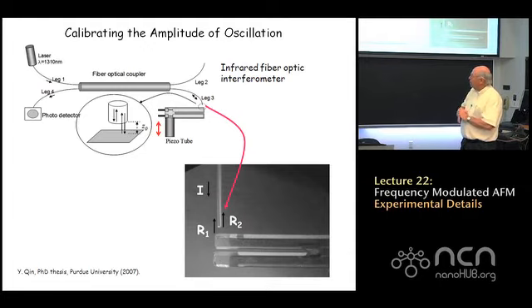The idea is sketched in the bottom right-hand panel of this slide. This laser interferometer basically takes infrared light and directs it through a small fiber optic. That small fiber optic is placed a small distance above one of the tuning fork tines. There's an intensity I that comes through that fiber optic, and that light is then reflected at 2 places. One place is the end of the quartz fiber, indicated by the back arrow labeled R2.